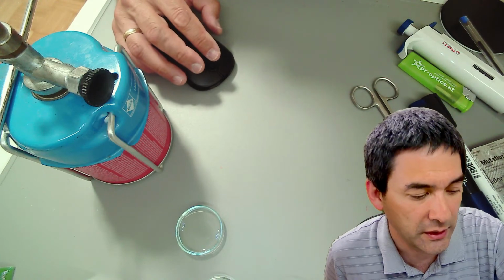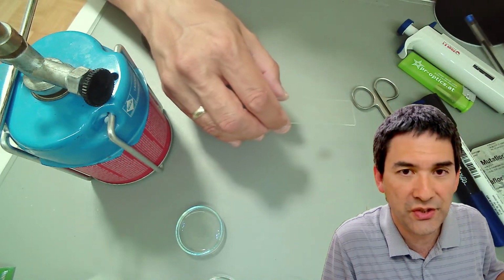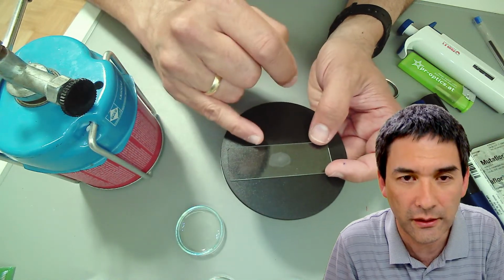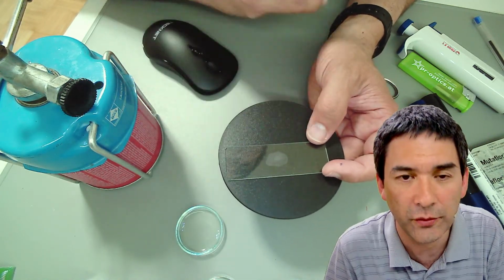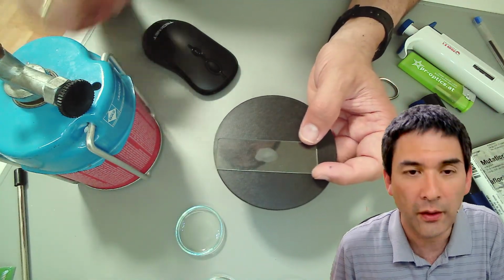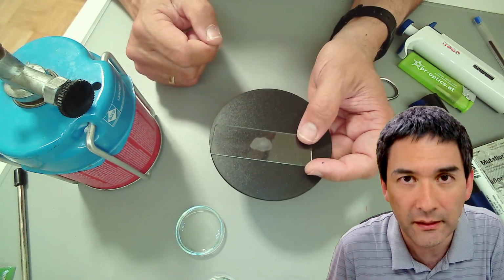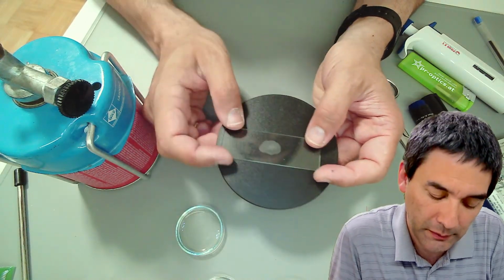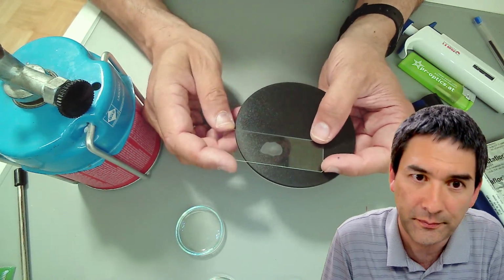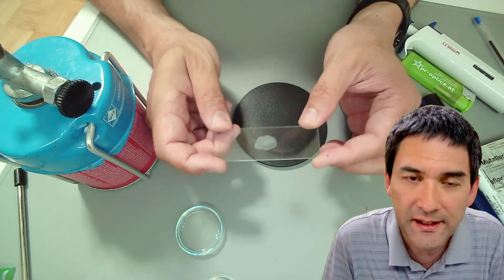fixing. Because what I've done here is I've already prepared, also very difficult for you to see now because of the lack of contrast, some bacteria a couple of hours ago on the slide with a little bit of water, and spread it and allowed it to dry up. Now, I also would like to stain the bacteria with methylene blue. The problem is that it's dry, but the bacteria do not stick to the glass yet. I want to bake them to the glass, and I do that by heat fixing the slide.